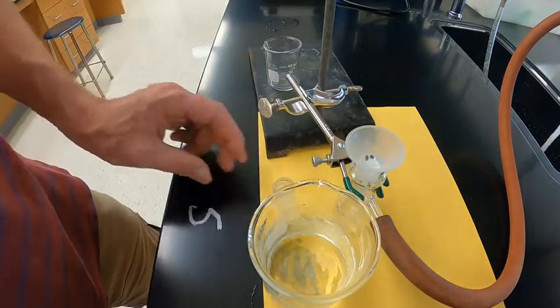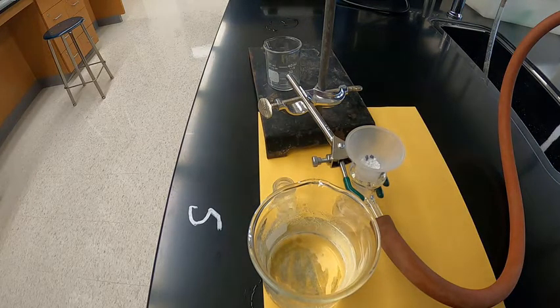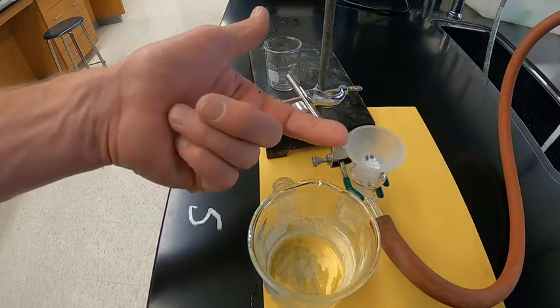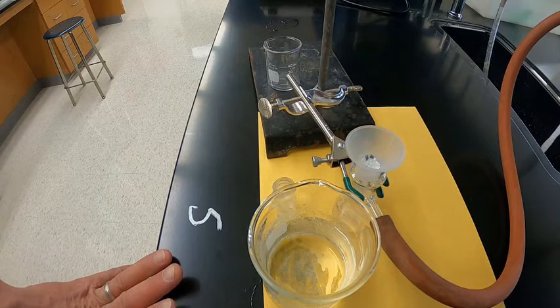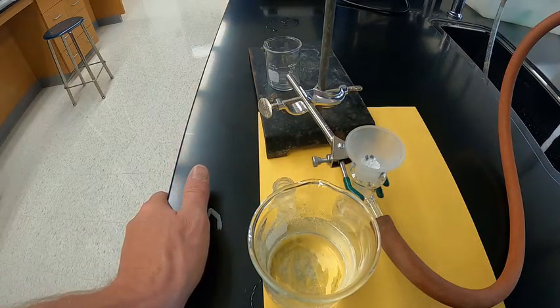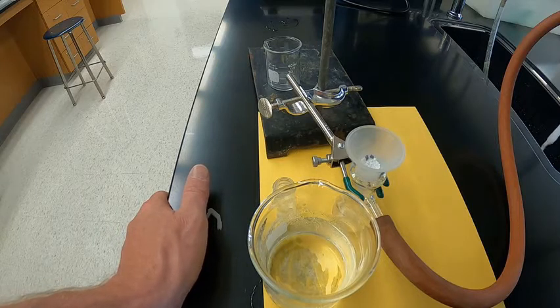So now what I'm going to do is just let the water run for a few minutes. And what that does, it allows the sample to air dry as much as possible, because the vacuum is just going to suck air through the Buechner funnel. So the drier it is, that means it'll be easier to get out of the Buechner funnel. It won't be dry enough to mass right at this moment, but what I'm going to do is let it dry and then come back and record the final mass and show you that. So I'm going to let this air dry some.